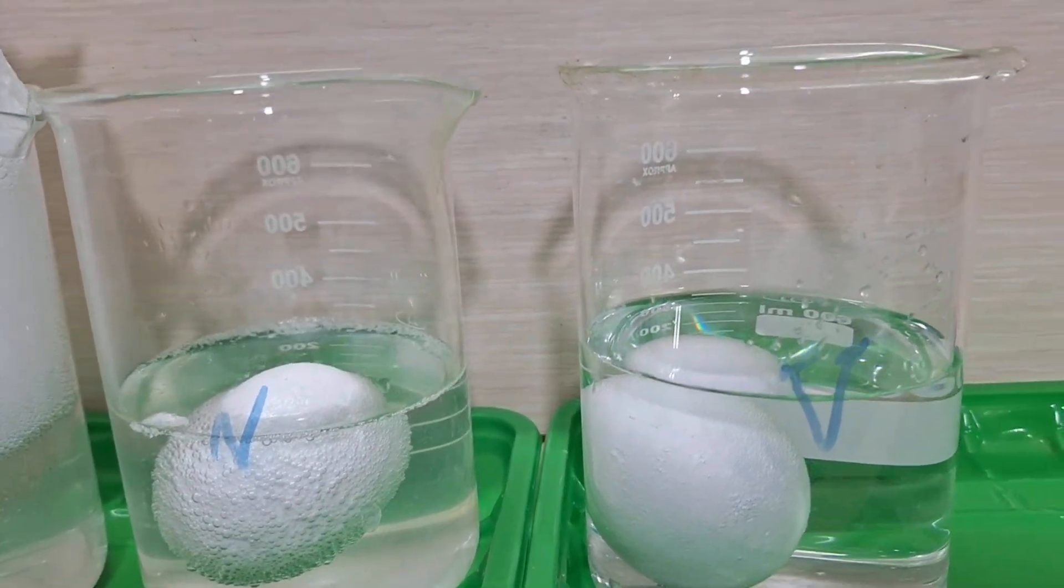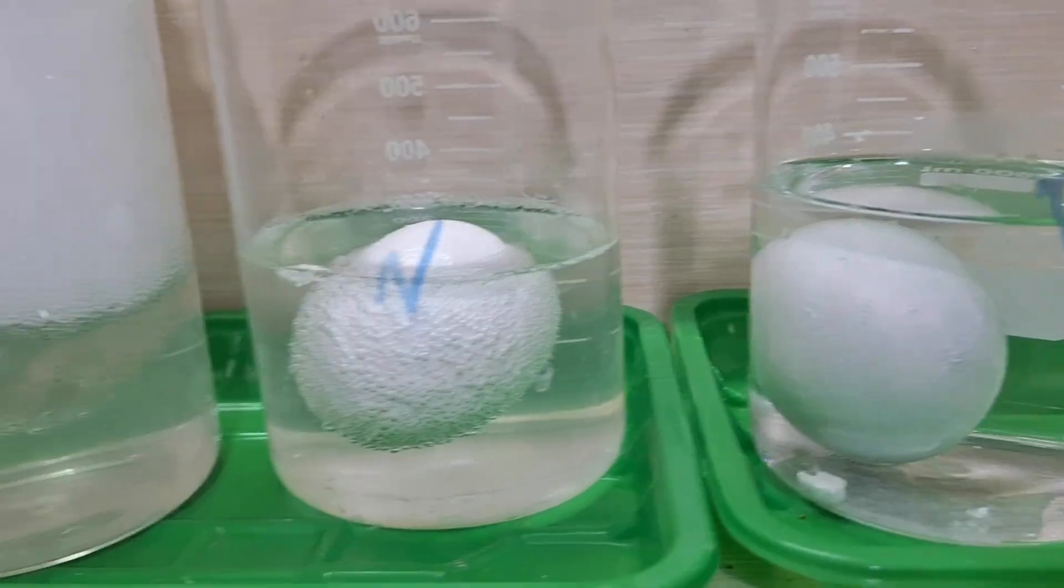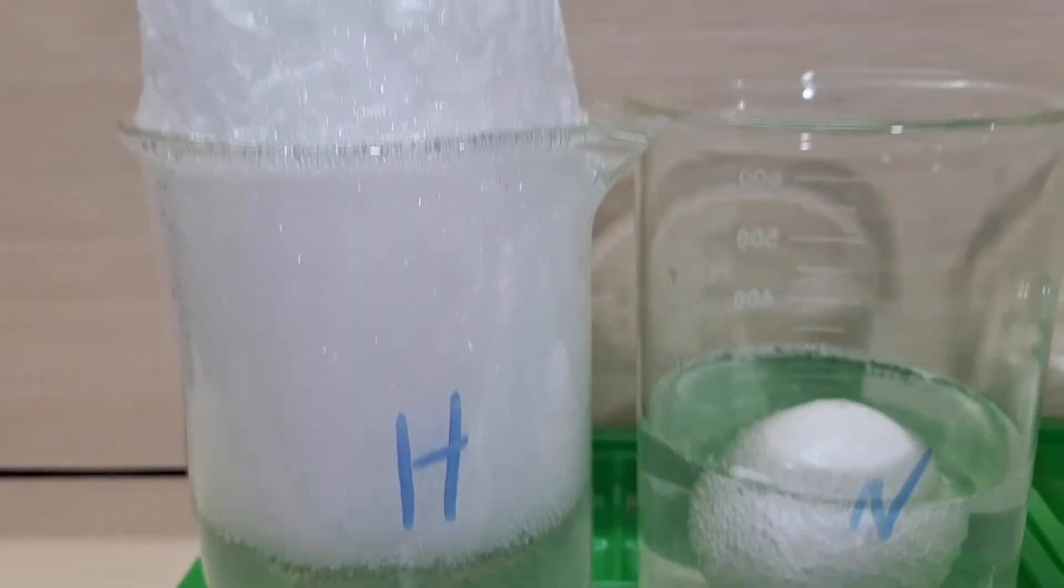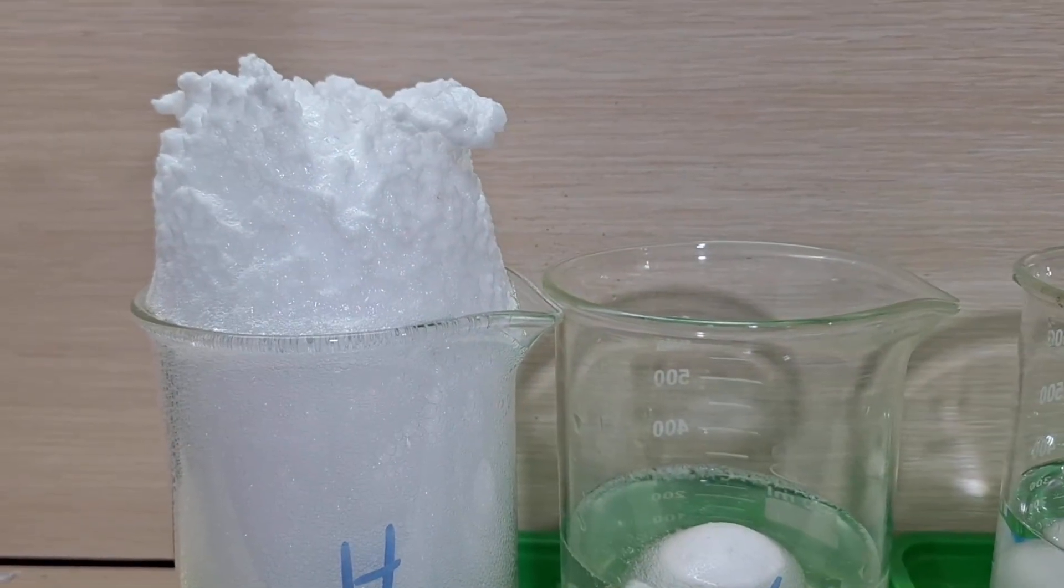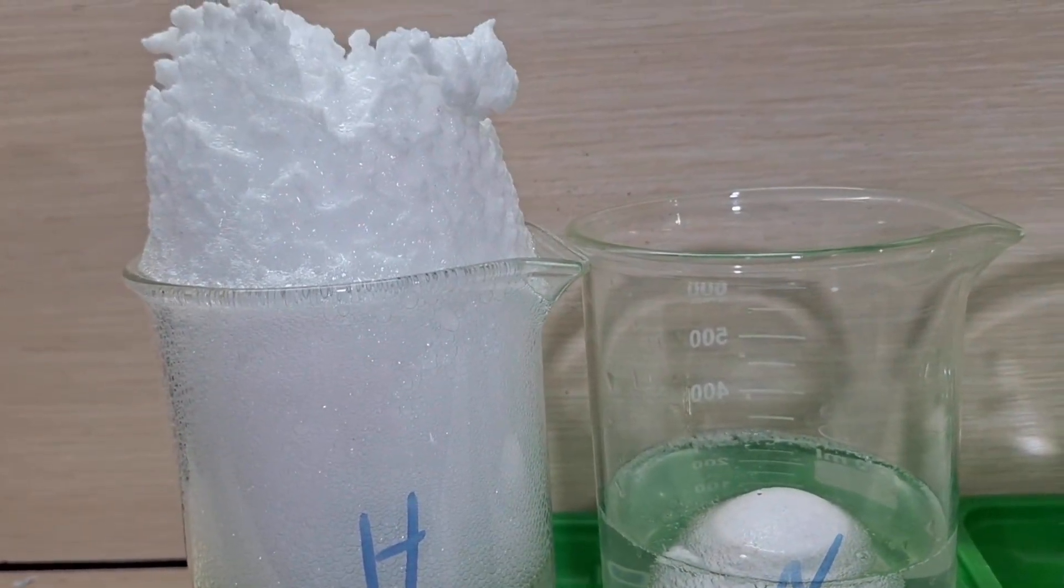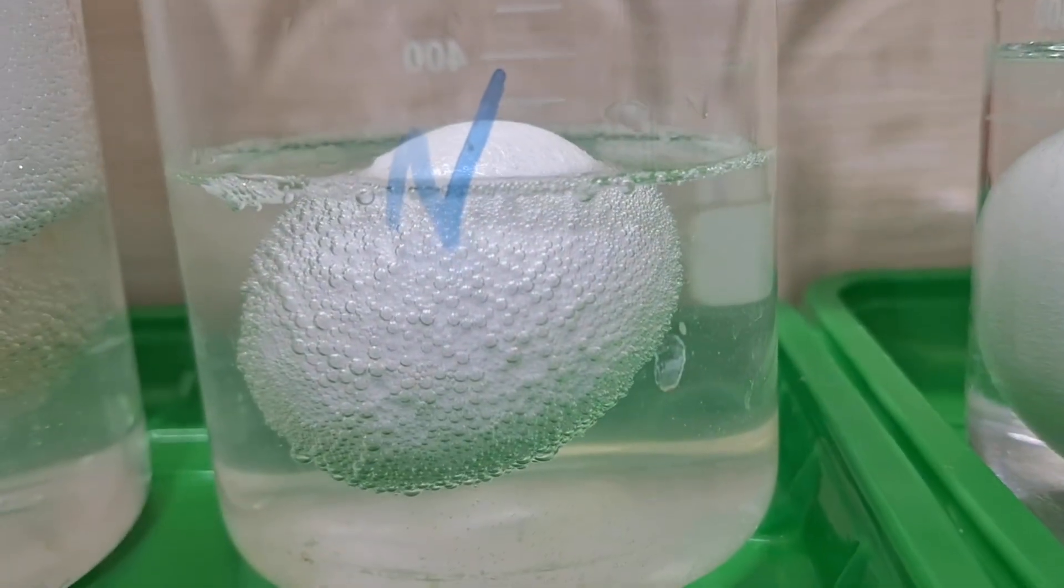As you can see in the video, the eggshell starts to bubble. Hydrochloric acid reacts most strongly with calcium carbonate and lime. This experiment demonstrates that ores with high lime content can be pre-treated by washing with diluted hydrochloric acid to remove the carbonates.